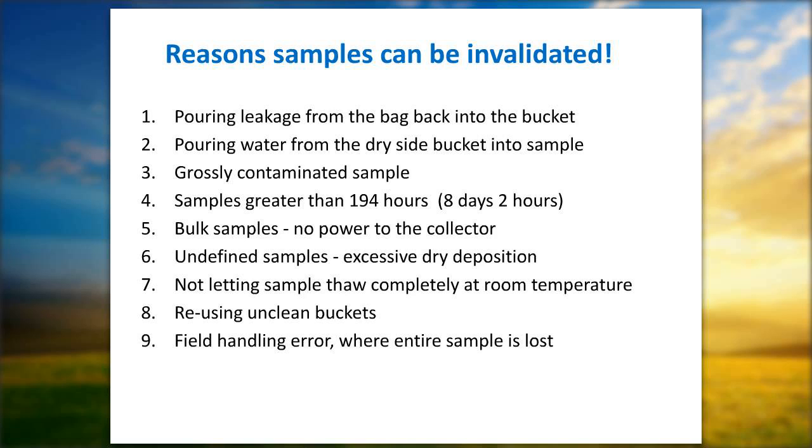Grossly contaminated samples, we talked about that a bit. We've had bats in samples, we've had snakes, we've had toads. We honestly look at the chemistry before we decide whether or not something's invalid, unless it's just completely corrupted due to vandalism. We highlighted number 4. I want to emphasize this with the upcoming holidays. We do hold 8 days, 2 hours for a valid sampling period.